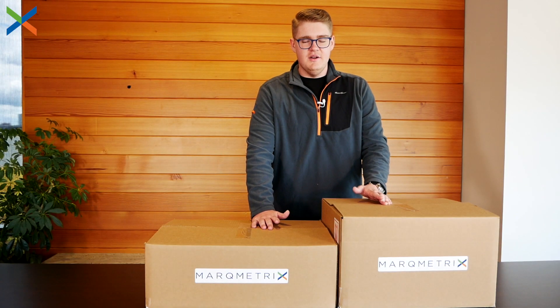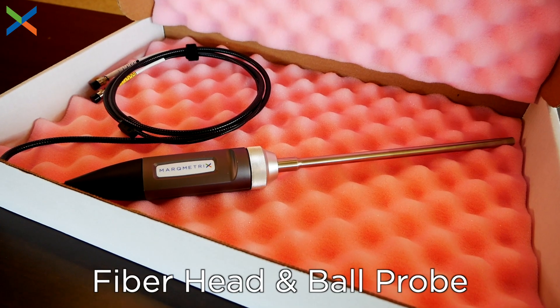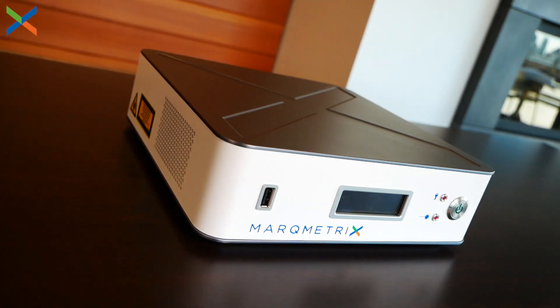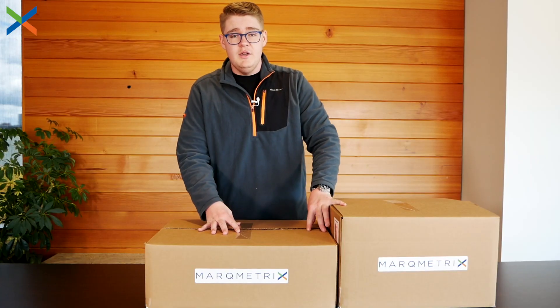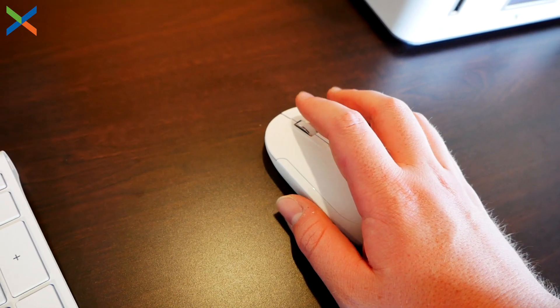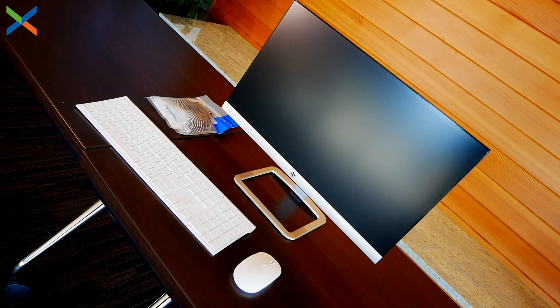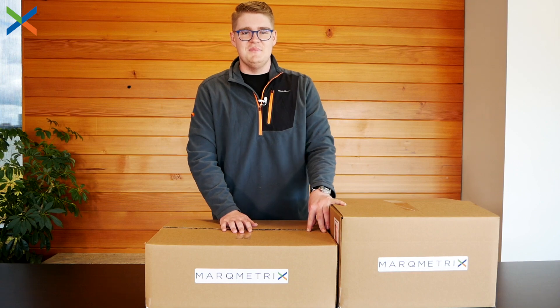Let's go ahead and start unboxing the all-in-one Raman system. You'll have two boxes. The first one here on my left contains the ball probe itself and the all-in-one system — this is the main equipment you'll use. This box over here contains your peripherals: your mouse, your keyboard, your display, and some extra cables to help get everything connected together.